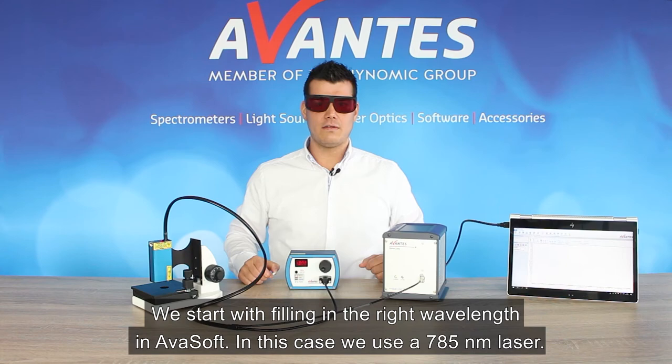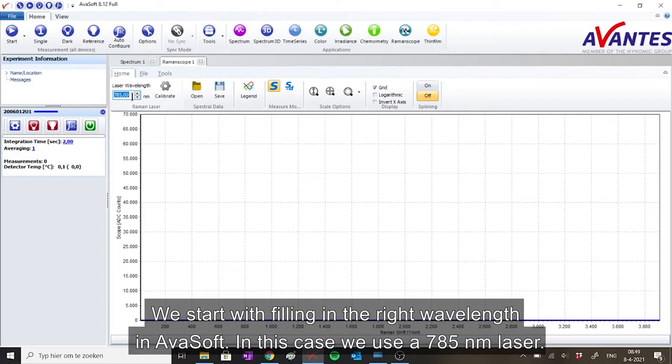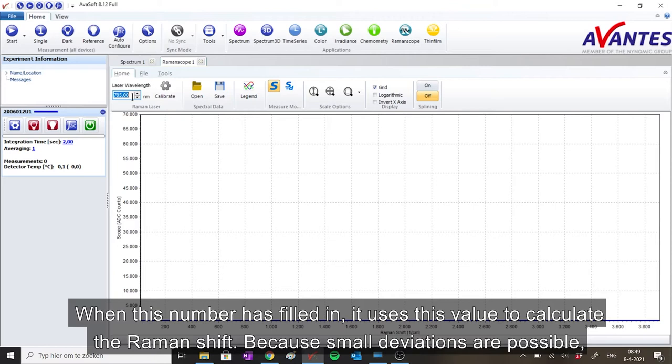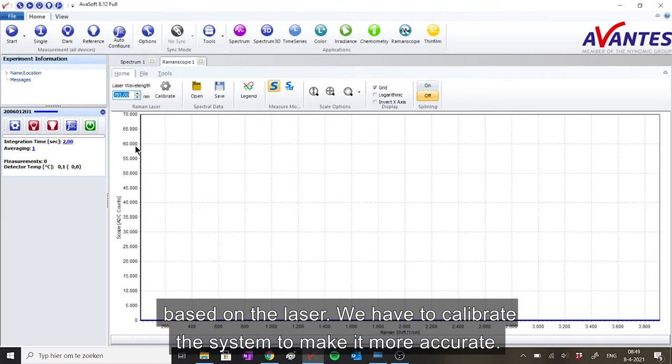We start with filling in the right wavelengths in AvaSoft. In this case we use a 785 nanometer laser. When this number is filled in, it uses this value to calculate the Raman shift. Because small deviations are possible based on the laser, we have to calibrate the system to make it more accurate.